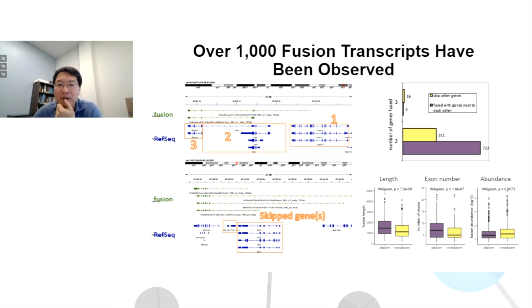Lastly, I just want to mention something slightly surprising to me: during the process we found about 1,000 fusion transcripts in this data. Typically when I think about fusion, I think about cancer, right? In cancer, there is translocation, and fusion transcripts are critical for oncology and things of that nature. So that is what I learned. But in normal tissue, I don't expect that to happen a lot.